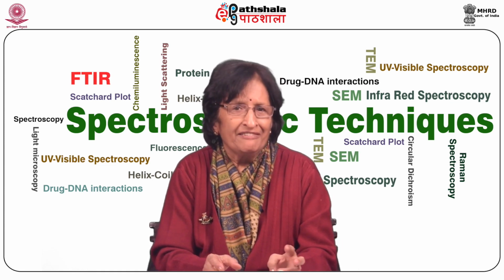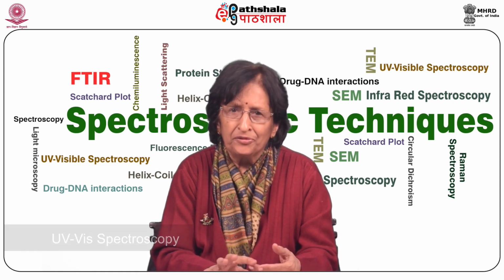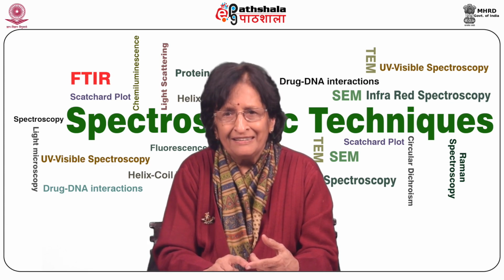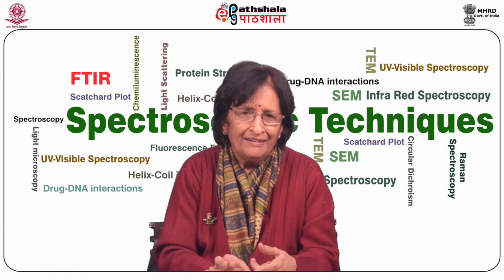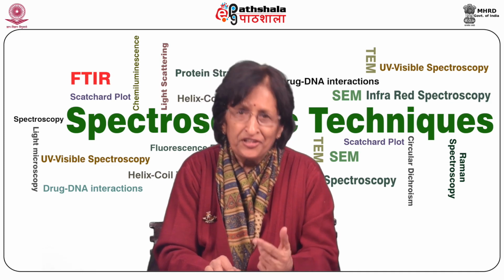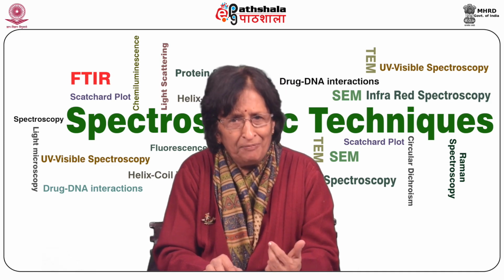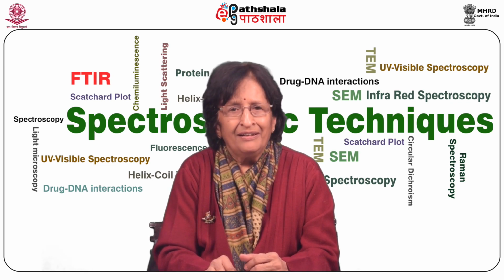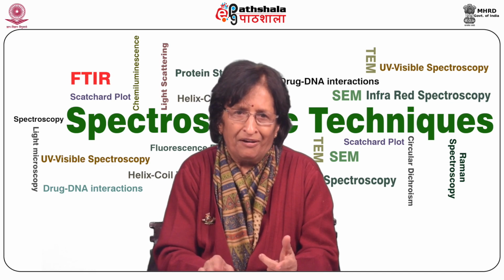UV-Vis spectroscopy refers to measurement of absorption or reflectance in ultraviolet, visible and near infrared region as a function of wavelength lambda of absorbed or reflected electromagnetic radiation. It is governed by Beer-Lambert Law. That's why we are going to study Beer-Lambert Law.